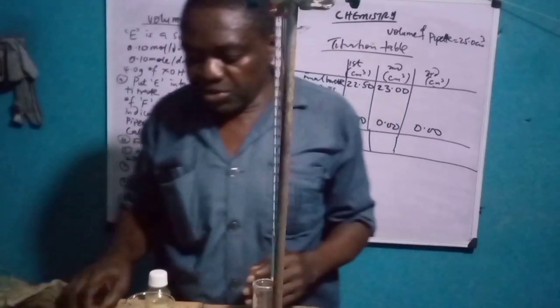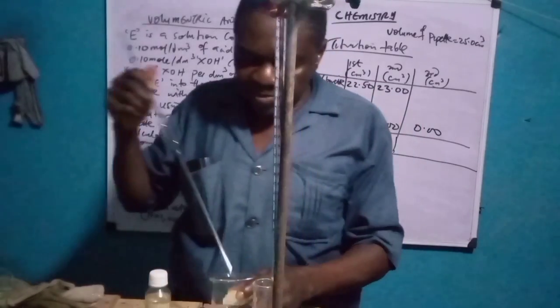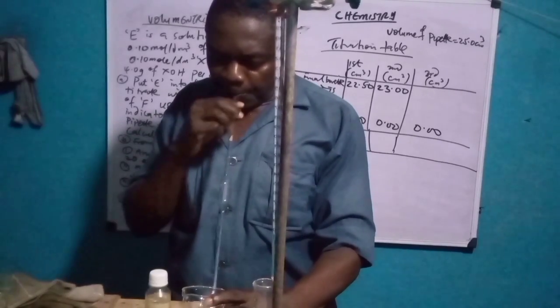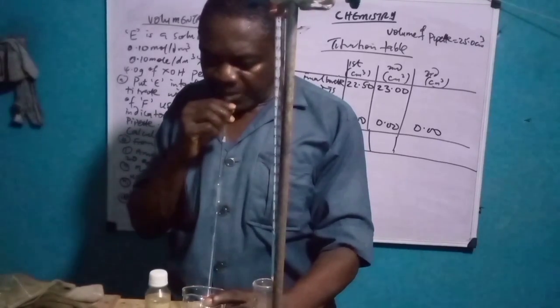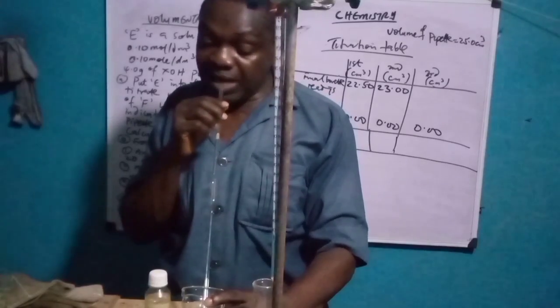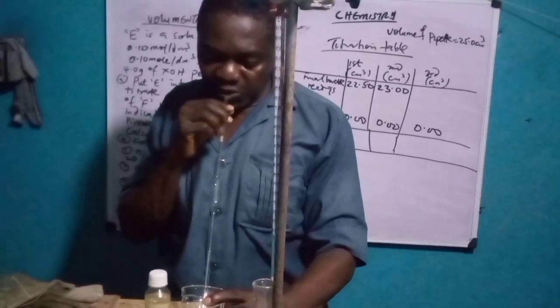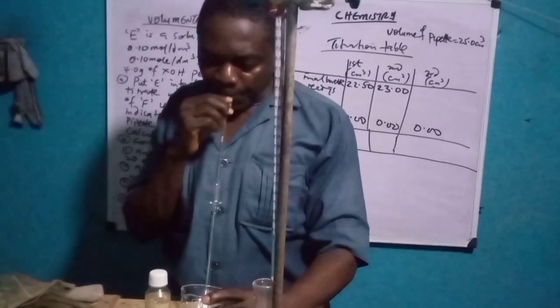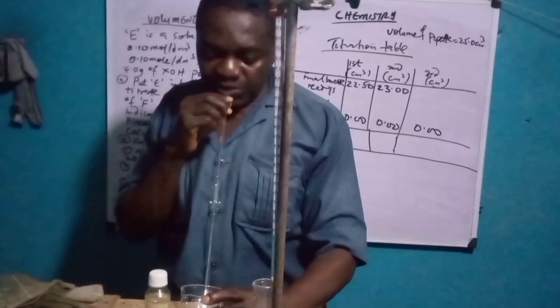I've topped it to the 0 mark again. Next thing is to pipette it. You can see I'm watching it when I'm doing it to avoid accident of rushing to my mouth. That one is not a precaution. Just for your safety.